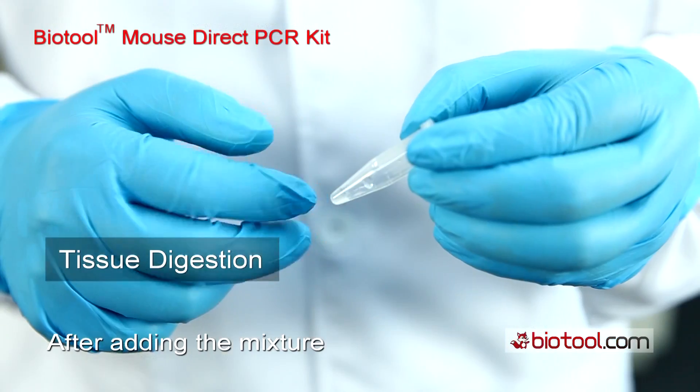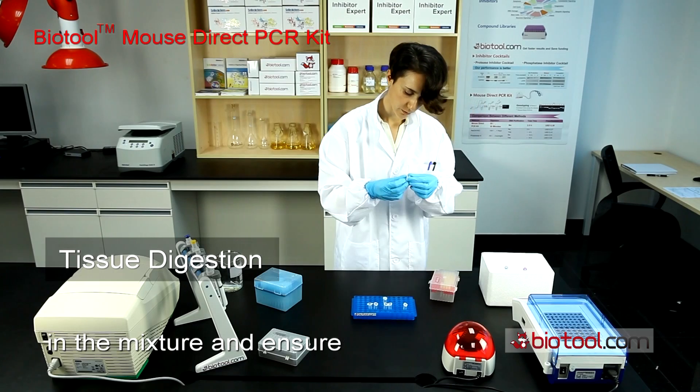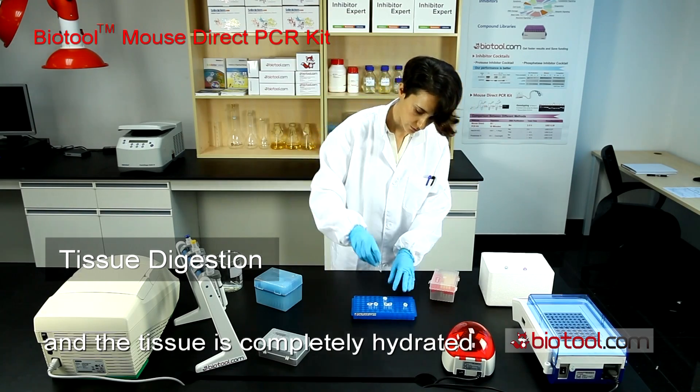After adding the mixture to the sample tube, submerge the tissue sample in the mixture and ensure that all air bubbles are dispersed and the tissue is completely hydrated.